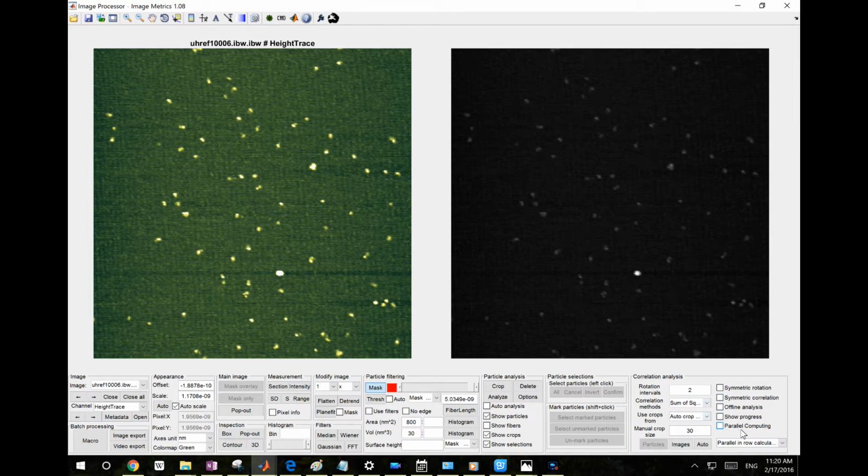I won't explain the parameters right now; I will explain them in more detail when you can read them manually. The one parameter I want to specify is rotation intervals. That means the action rotates every molecule. When you analyze one molecule, it rotates all the other molecules and tries to find the perfect match. When it rotates at a specific degree, you can choose the rotation intervals.